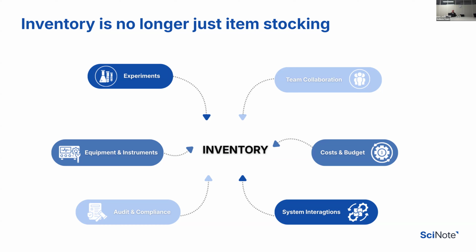Then it needs to be ready for audit and compliance. And one thing which we heard about lately, but nobody from the audience today mentioned this, is that it has to be connected to equipment and instruments more often, so to raw data. We've seen and heard this one a lot more in the last few weeks and months.